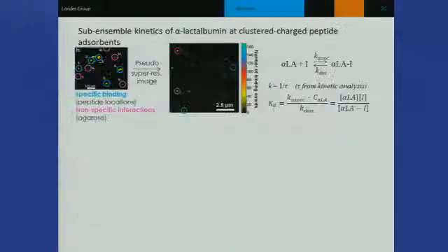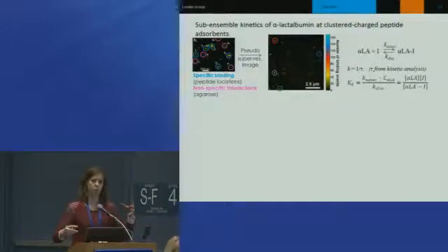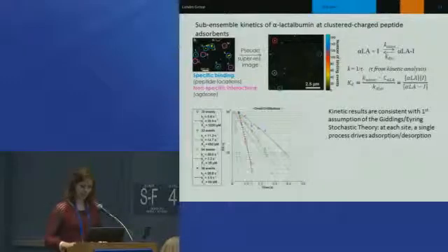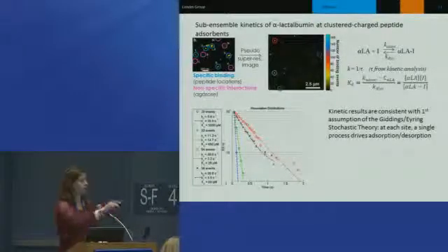the peptide. And as I said, we can treat all of these individual ligands now as individual little adsorption centers, and we can collect the rate constants for the adsorption and the desorption kinetics for all of these different sites. And for the first time, test really the first assumption of that Giddings and Eyring theory, which is somewhat of a surprise to us, but maybe things would be different if we used a more complicated protein.